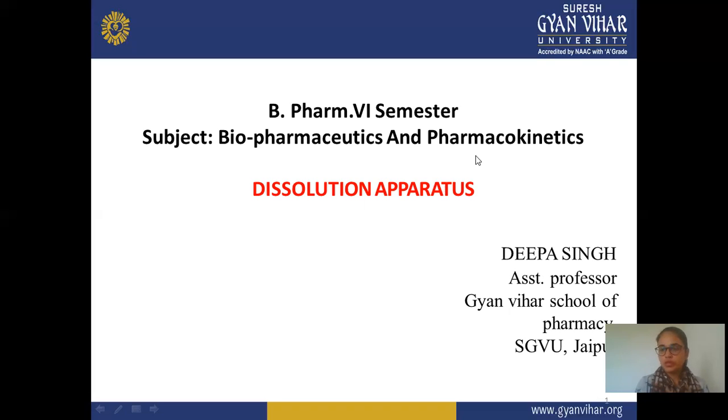With the help of these models or equations, you calculate how much drug dissolves in a particular equation or in a particular formulation. Today we discuss dissolution apparatus. These dissolution apparatus are very important for performing the dissolution test, because without these apparatus, you cannot perform your test. And different types of these apparatus are available according to the pharmacopoeia.